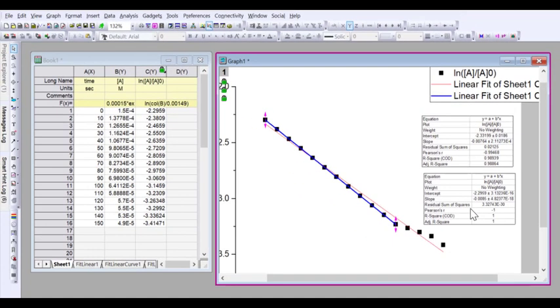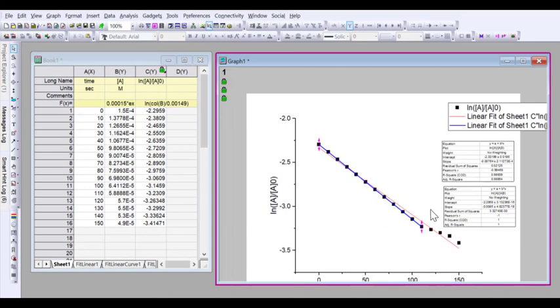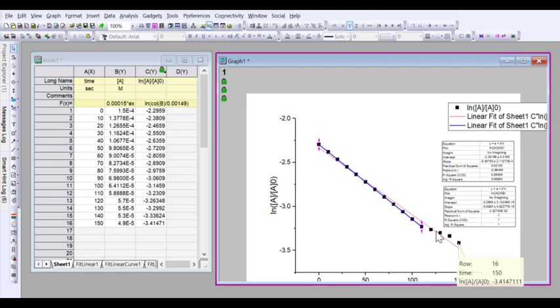So this is giving us some data that we can report and say, well, if we take all of this data, including the bit where it's skewed off, this is our slope. If we take just a bit where it's linear, this is our slope.